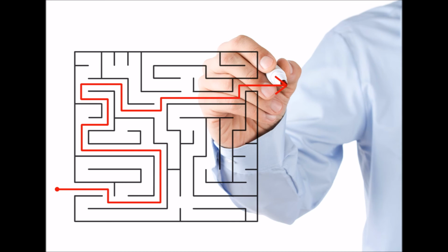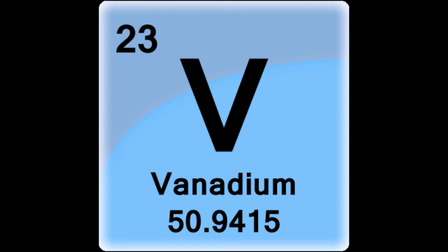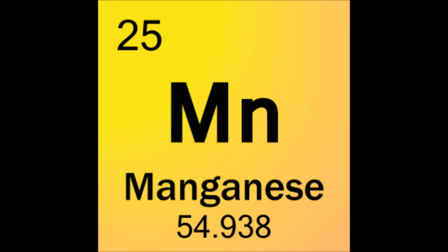Because ESR can analyze free radicals and transition metal compounds, there are many applications for electron spin resonance spectrometry to be useful in the world we live in today. An example of an analytical application would be that ESR is a rapid and convenient method for determination of vanadium in petroleum products and can measure and detect traces of manganese 2+ ions.